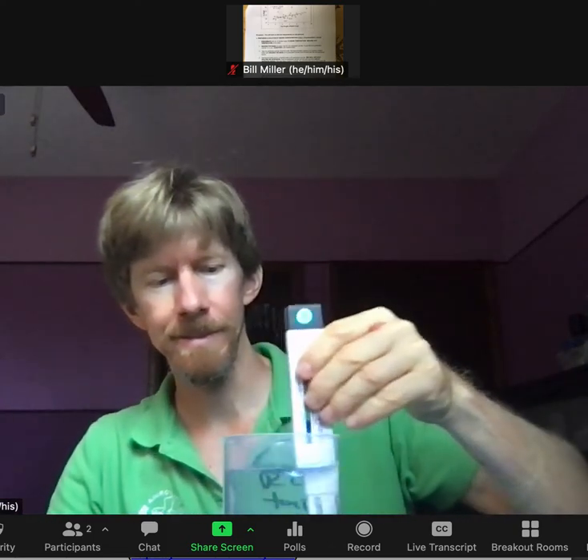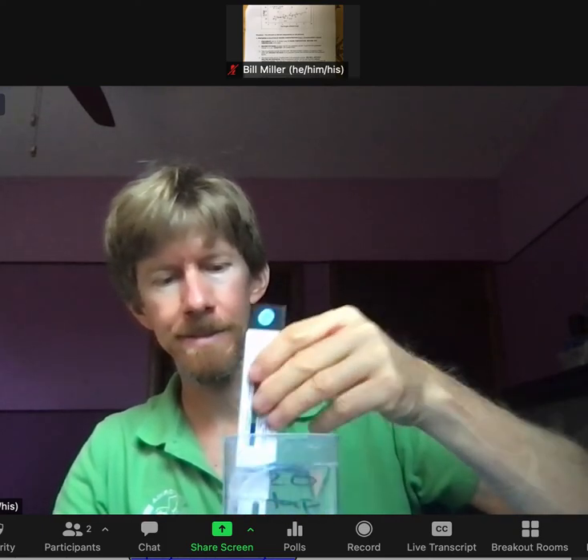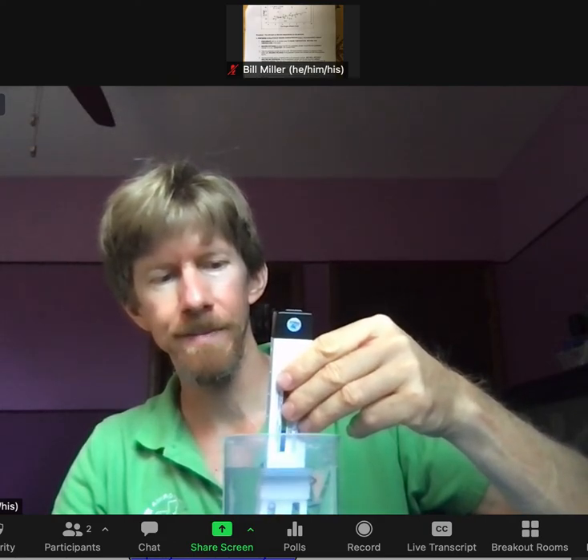This is experiment number three: density of saline solutions. Instruction one: equilibrate 400 milliliters of distilled water to room temperature and record the temperature. I'm getting 23.4 degrees Celsius, pretty constant because I've let it sit for 10 or 15 minutes while setting up. Under temperature of the water for the 5-gram sample, it's 23.4 degrees Celsius.